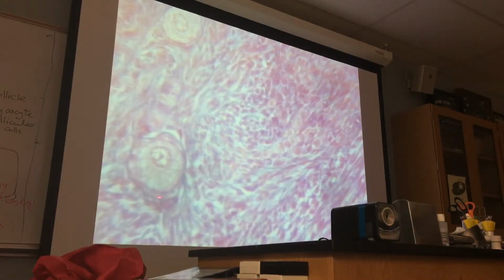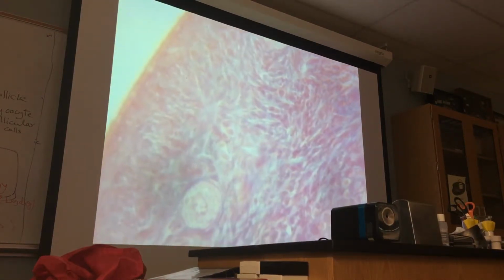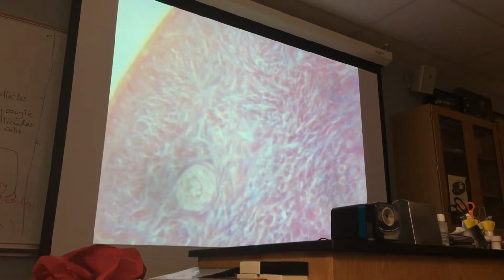These are the follicular cells, and this is the primary oocyte. I did get a good one, and then, this one. There you go. One primordial follicle, whole structure. But if I ask you to identify the cell here, what should be your answer? No. Primary oocyte.